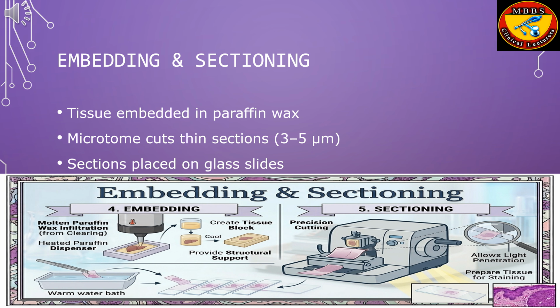Such thin sections allow light to pass through them, making microscopic observation possible. The sections are carefully transferred onto glass slides and prepared for staining. Good embedding and sectioning techniques are essential because poor section quality can interfere with diagnosis and microscopic interpretation.